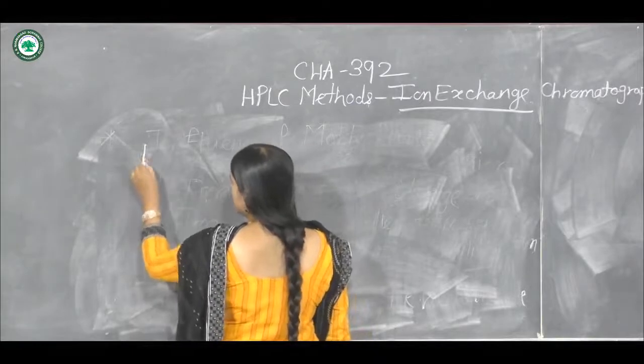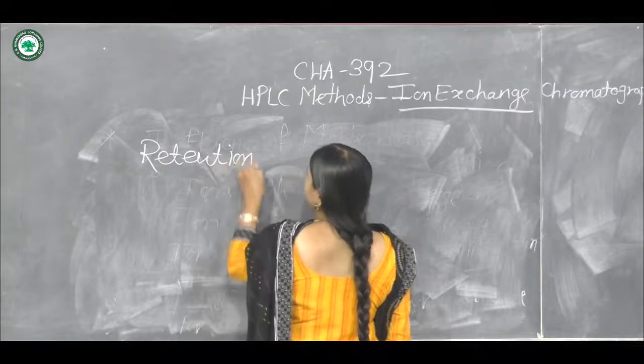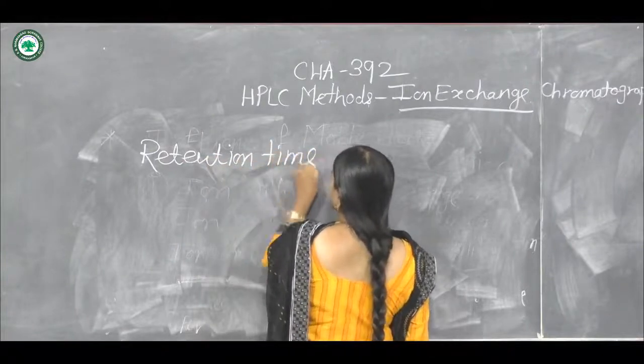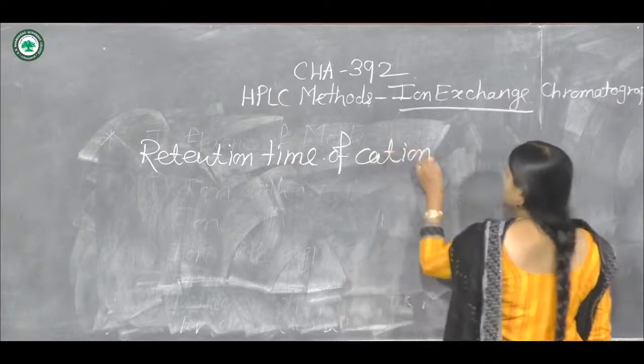So the next is the retention time of a cation exchanger.